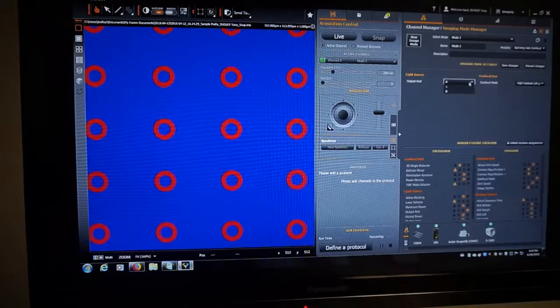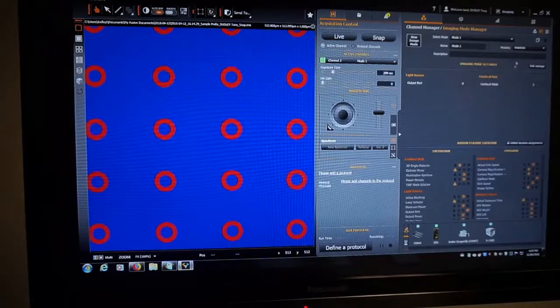And I also have to say what output port is associated with that. Okay? And maybe I want it to be a wide field mode. So it's a little bit kind of strange in the way that you have to associate the thing twice with itself, right? So you want these to match each other. And then of course you would click save. Okay? So I admit that that's a little bit confusing why you have to do that.